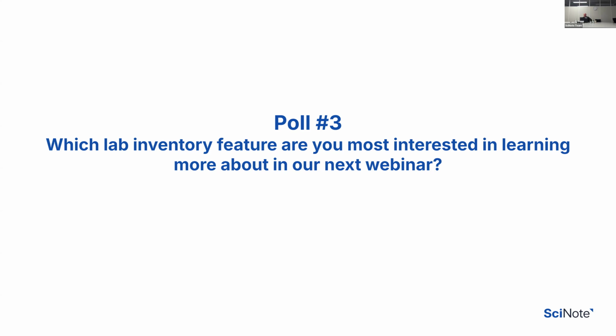Okay, yeah. Label printer compatibility. Oh, a lot of questions. Okay, good. So let me share the results first, and then I'm going to dive into the questions. I'm going to try to cover as much as possible. But first, before we go into the questions, just check.